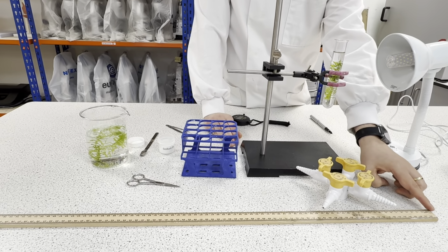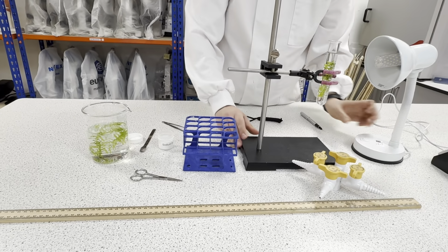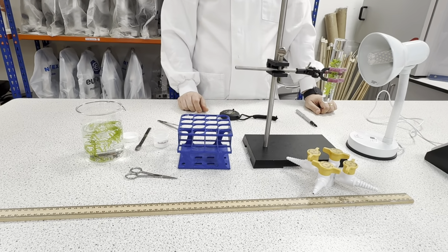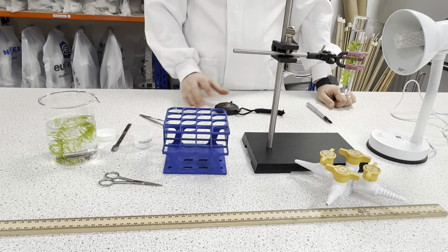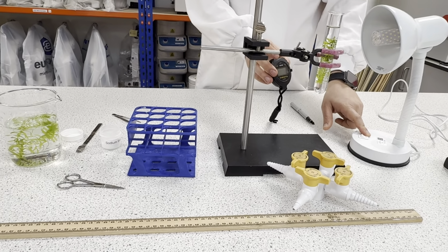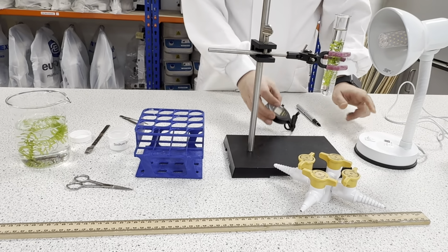So here I have 1 meter, so my plant should be 10 centimeters apart. And I will start the timer along with the light, and I will check it's working.